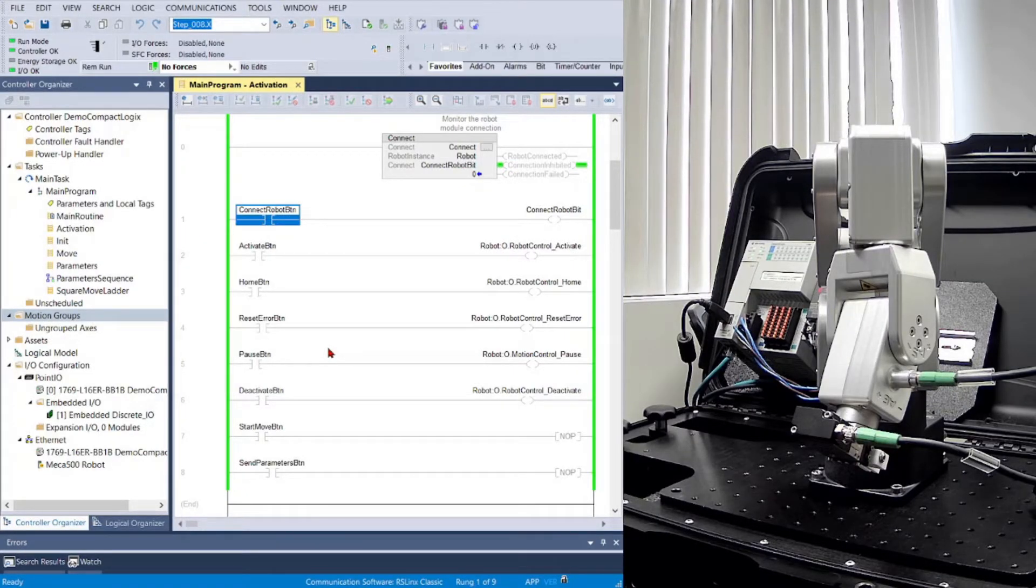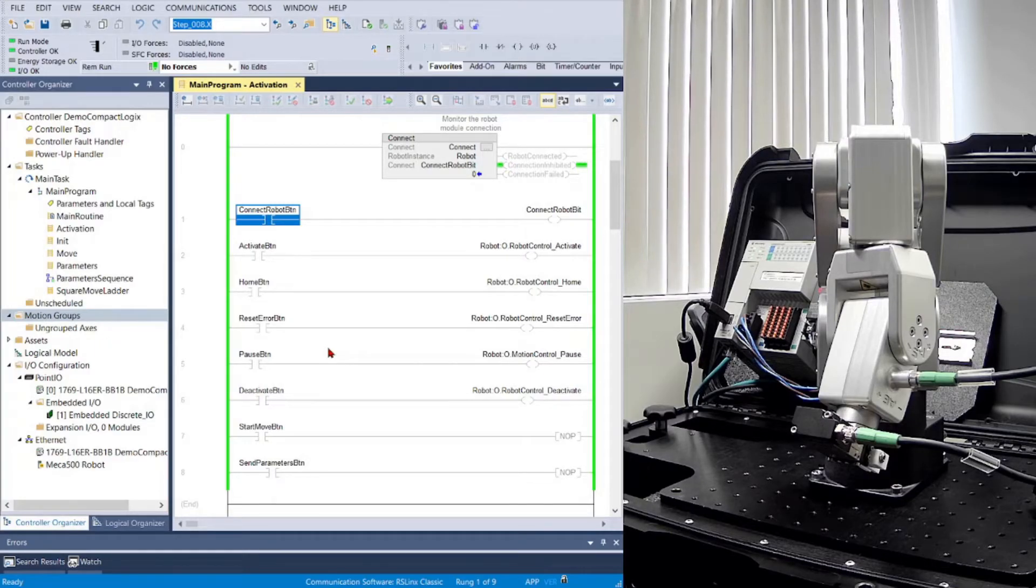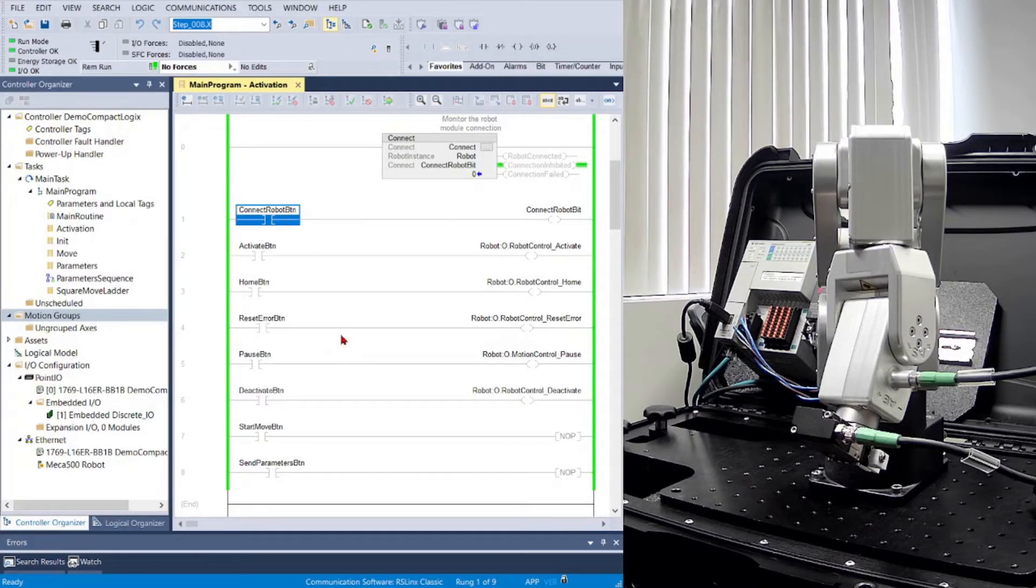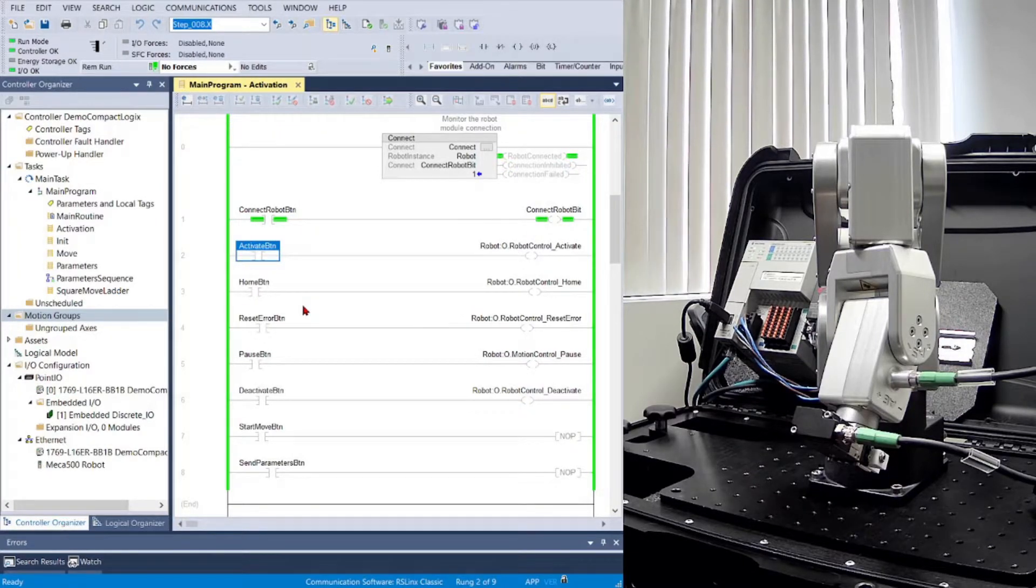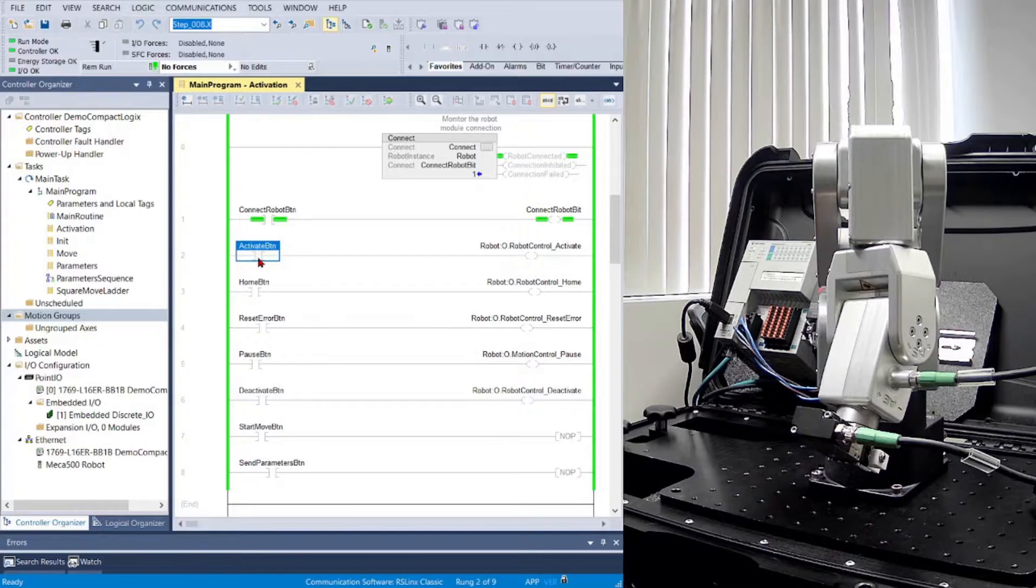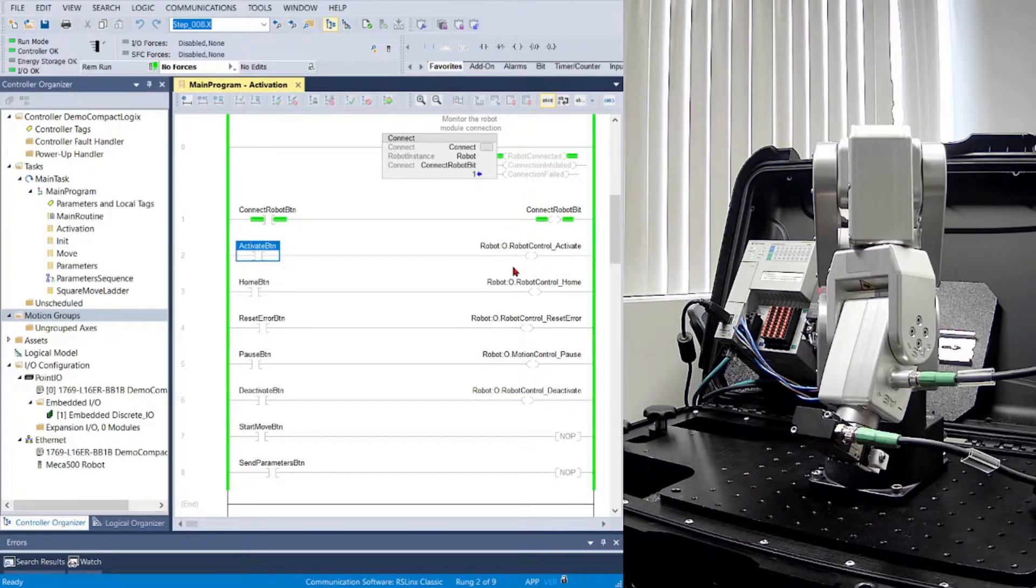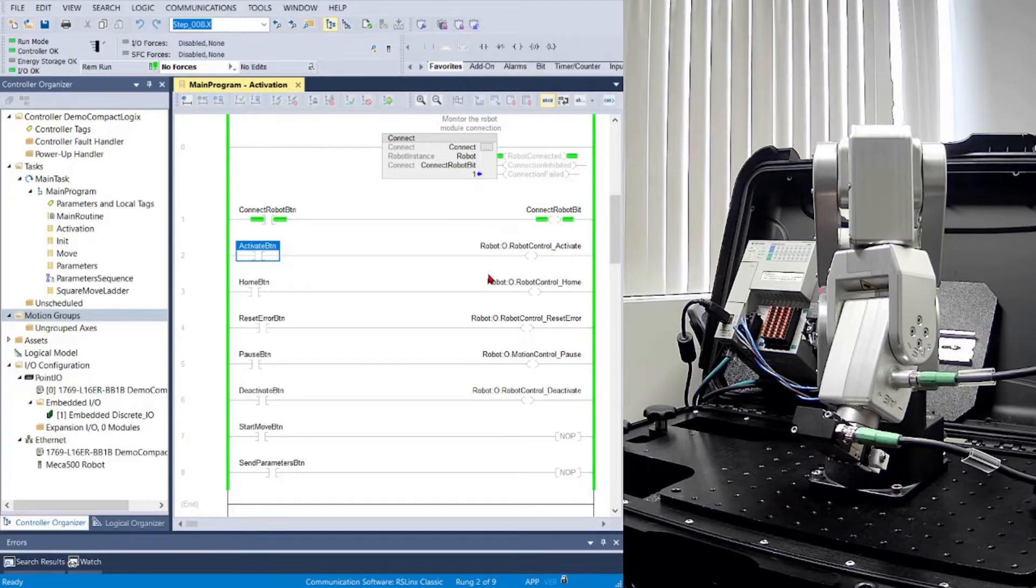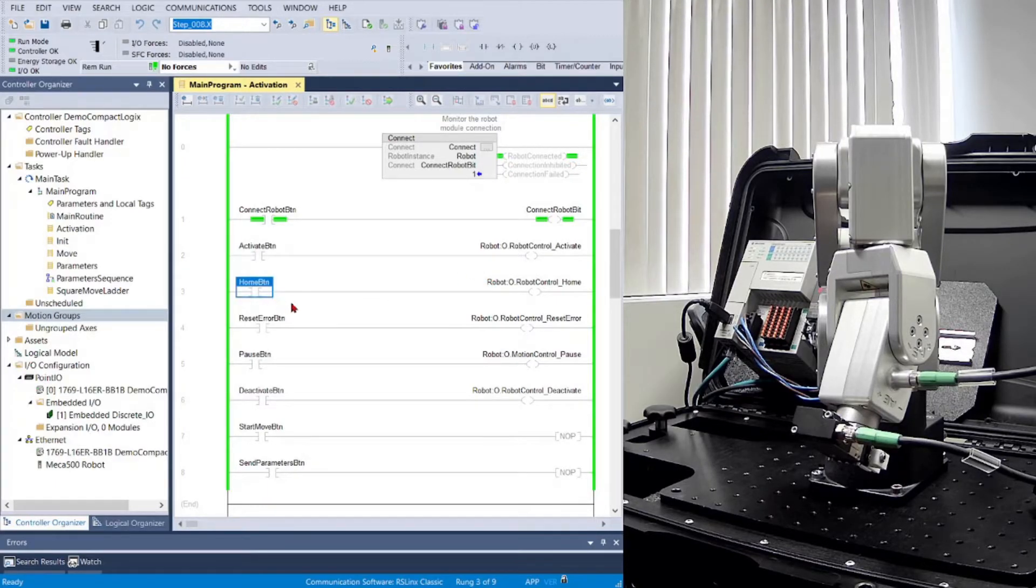Each of the same commands from the TCP IP mode are also available with the Ethernet IP mode. First, we'll enable connection to the robot. Next, we'll activate the robot. You'll notice that this bit only has to stay active for a moment to send the command. Once you hear the click, the robot is active.